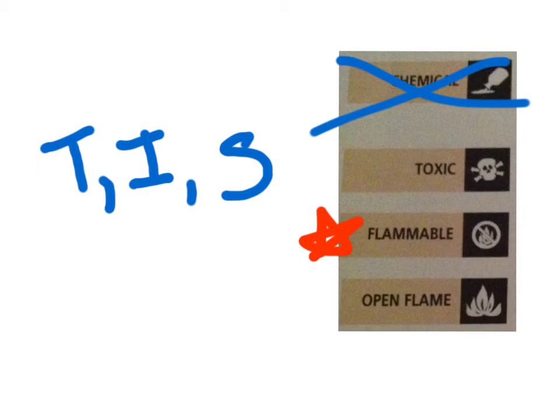Okay? This is the one that we see the most because whenever we use a Bunsen burner, that's going to be there. The one above, the flammable with the no symbol across the flame, is when we're dealing with chemicals like alcohols, kerosene, anything like that, that we want to avoid open flames when we have those around because the object we're using is flammable.